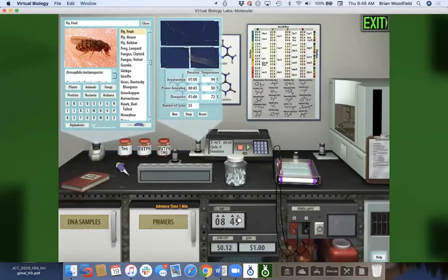I'm in the denature stage of things, and so it's going up, and I can now advance to my anneal. I can advance again to go. Now I'm going to elongation, so I kind of missed it because I'm only advancing by 1 minute. So here's my animation showing elongation. So we have these animations showing what's going on, and then we start showing that we're amplifying these things as they go.